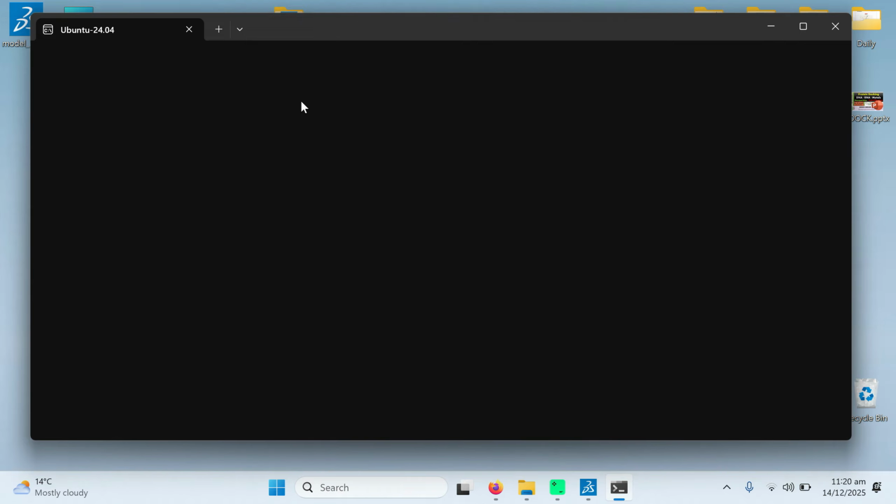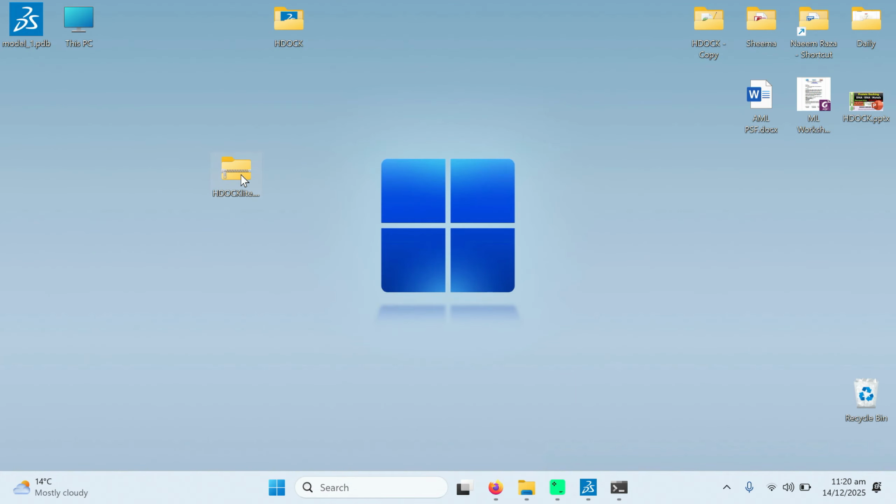This is basically Linux based. It is not so difficult. It is very easy to use. We have prepared commands for you and we will guide you step by step on how to use it. If you are interested in more, we will provide the complete installation link in the video description section, where you can simply install Ubuntu successfully on your laptop.